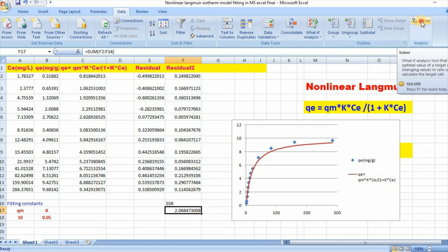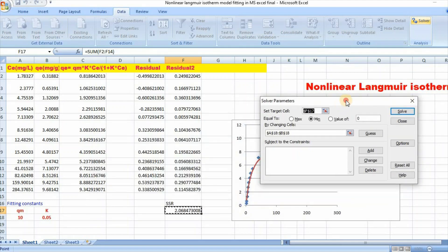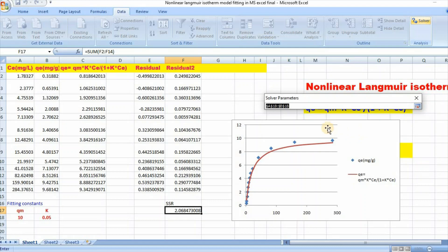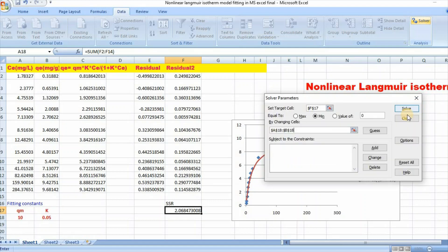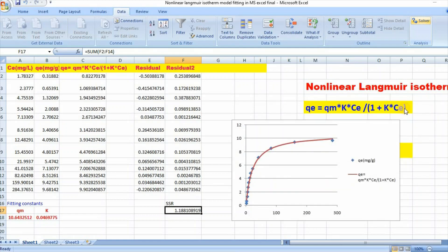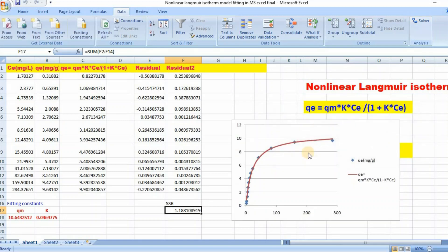So then go to Solver, and our target cell is this, and set it equal to minimum value. Then click Enter. OK.